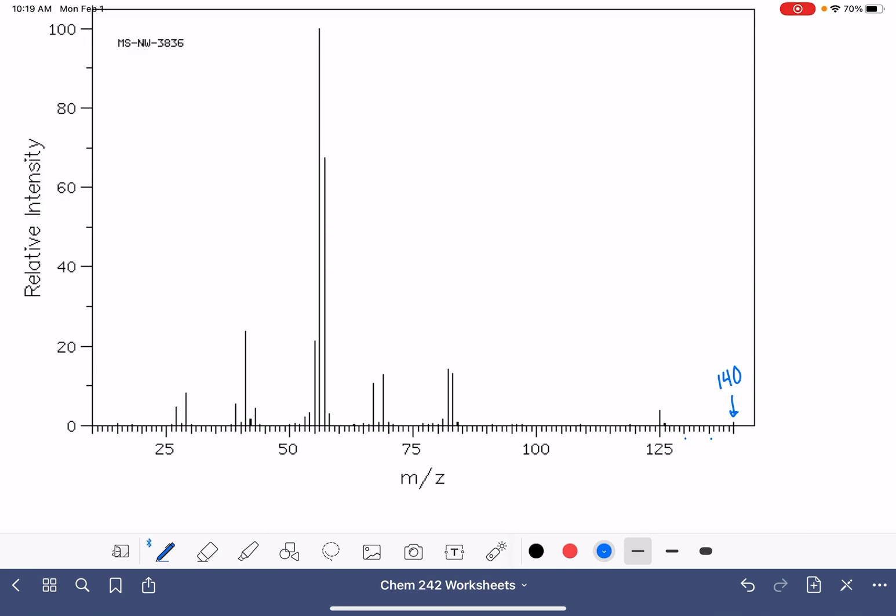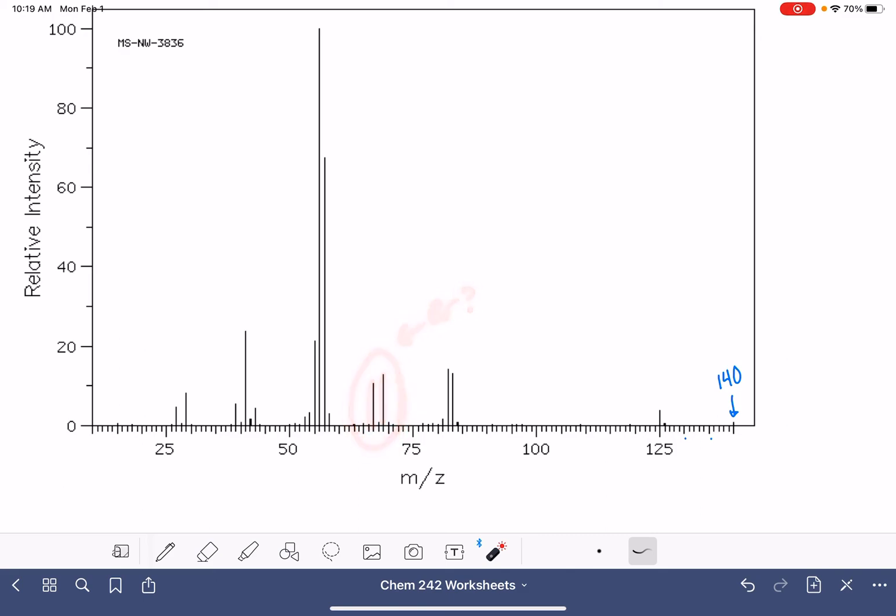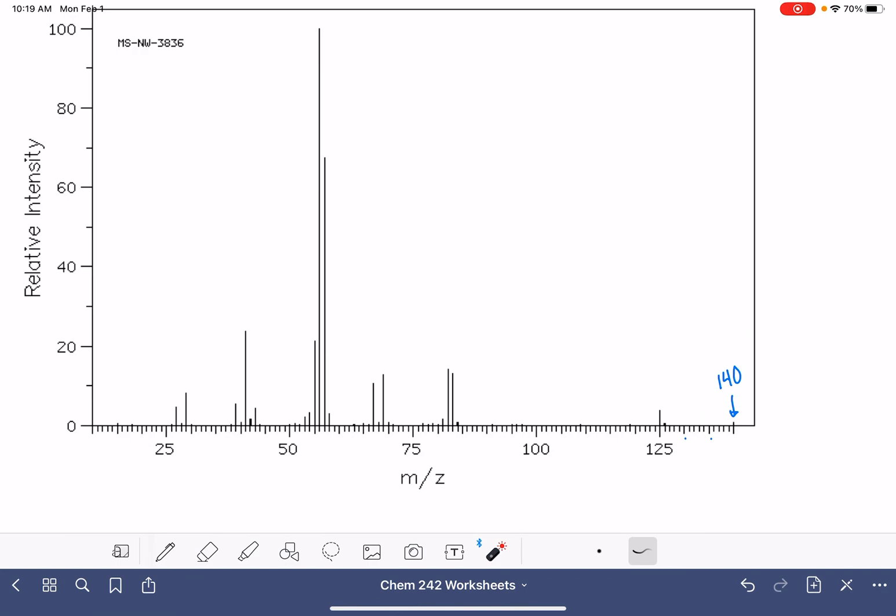Sometimes students will see something like this and they'll think, oh, does that mean that there's bromine? There's two peaks that are two units apart that are roughly the same height. That is only the case when those peaks are present over on the right hand side, on the molecular ion side.